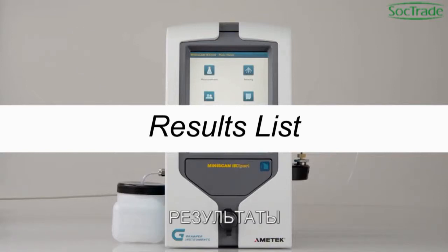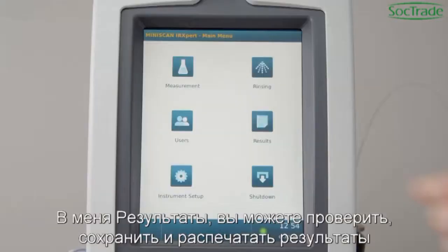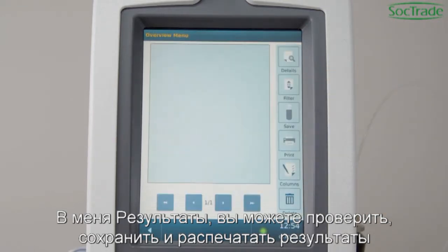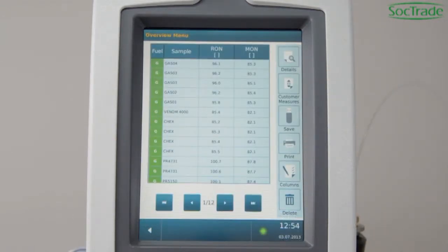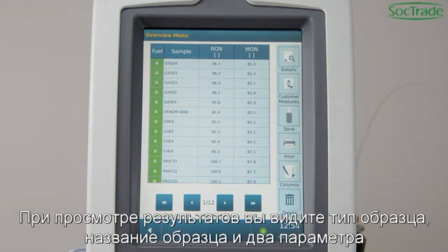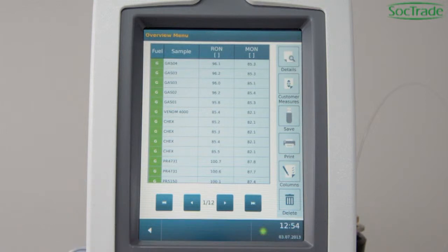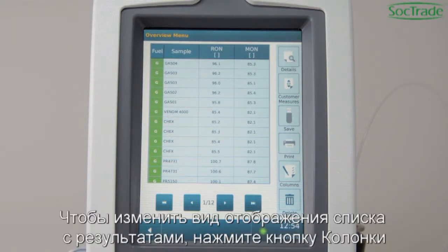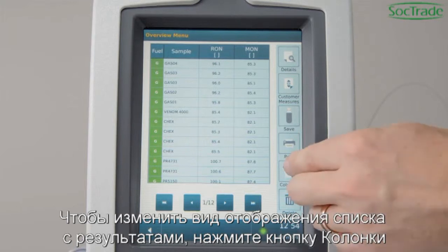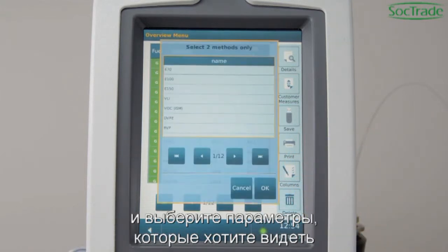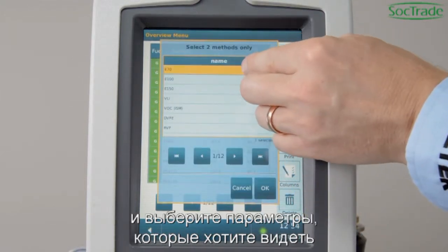Results list. In the results list, you may check, save, and print results. The results list view shows sample type, sample ID, and two parameters. To change the results list view, select Columns and select the parameters you want to see.